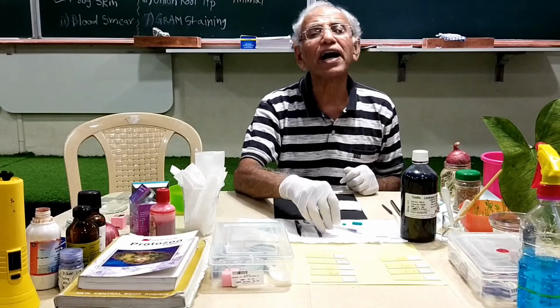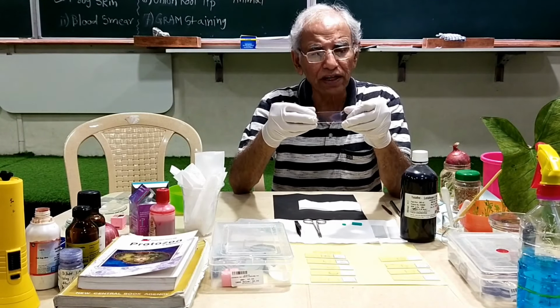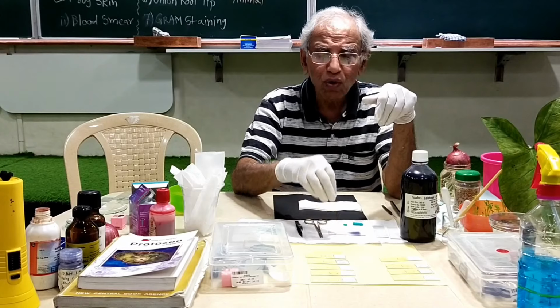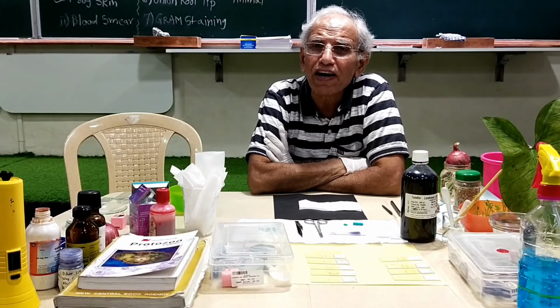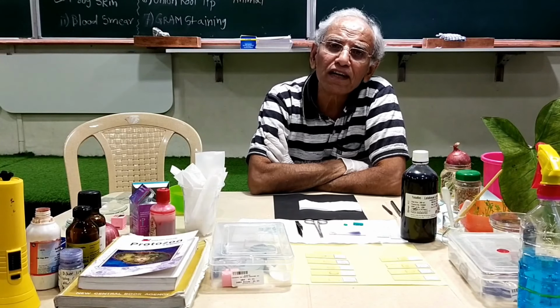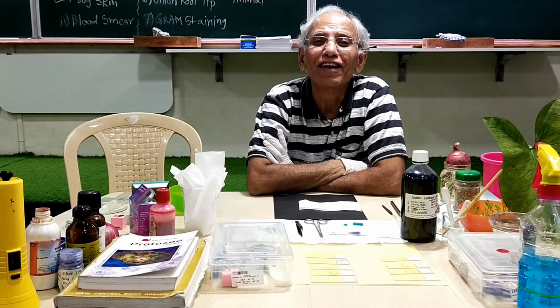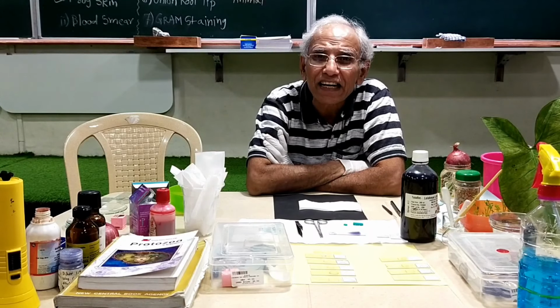Then this prepared slide of the blood smear using the Leishman stain will also be put under the microscope and you can see white blood cells. White blood cells will be observed only if the staining is done. But for red cells, you don't require any staining. And one more thing, when you are going to observe the red blood cells, erythrocytes, don't expect them to be seen as red.